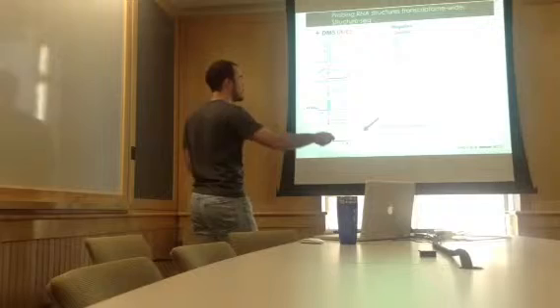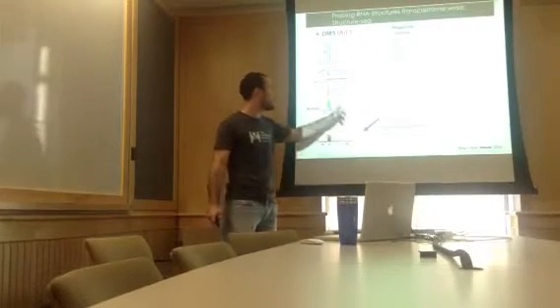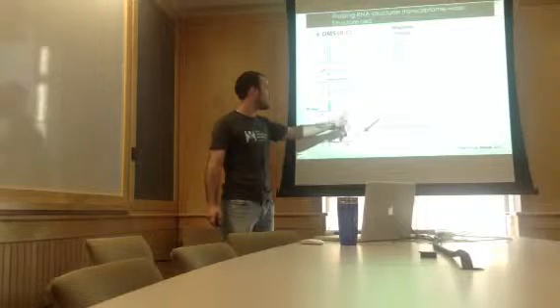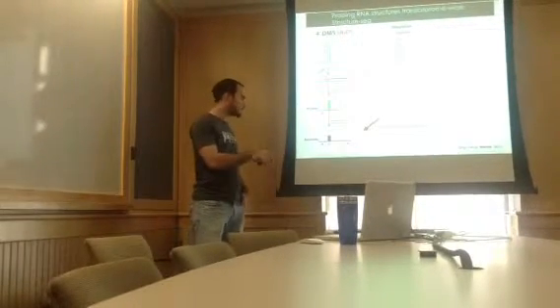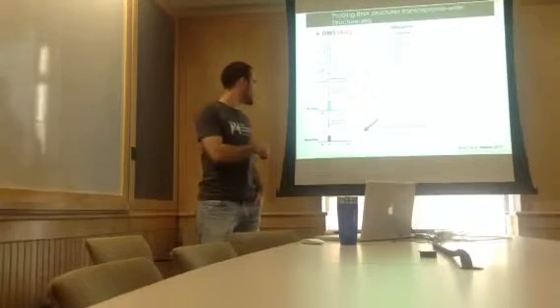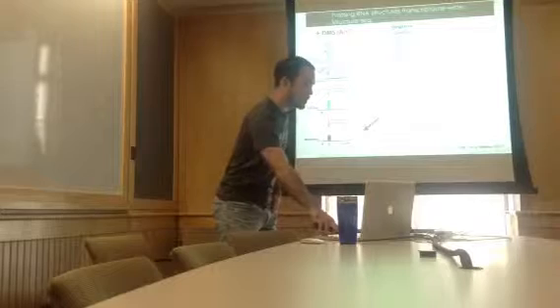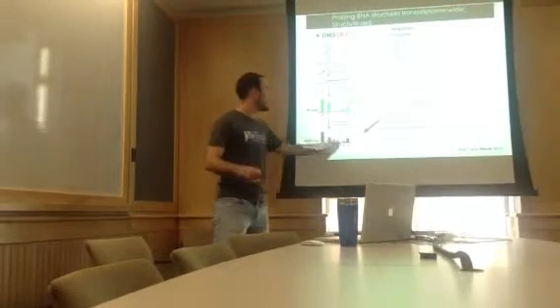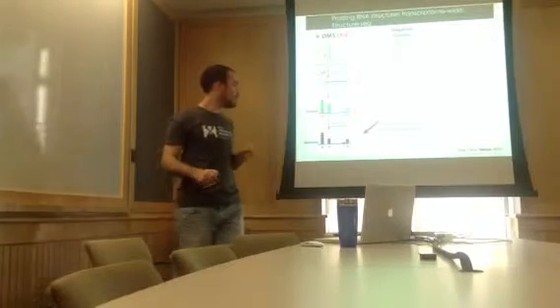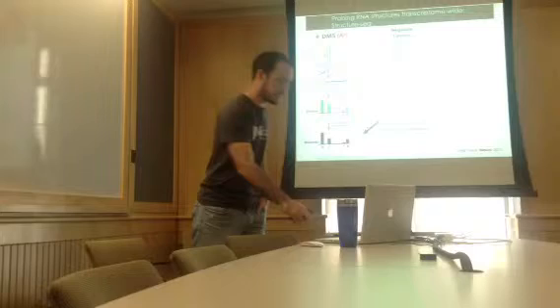And this negative control will be used for subtraction after normalization for the depth of sequencing, and then subtracted to get the normalized reactivity for the DMS condition. And because we have more than one molecule, we will be able to obtain at the end a profile of reactivity for each nucleotide inside the transcript.